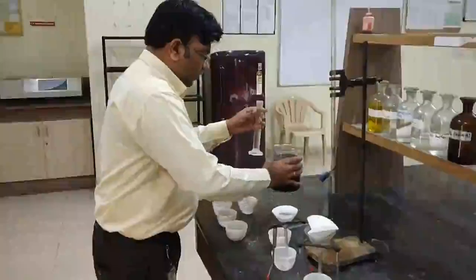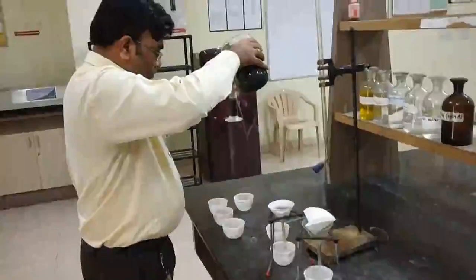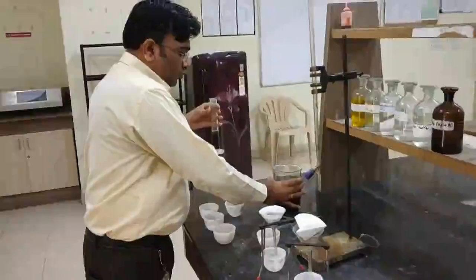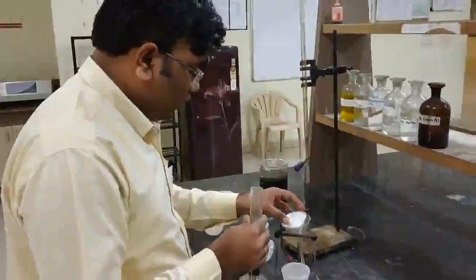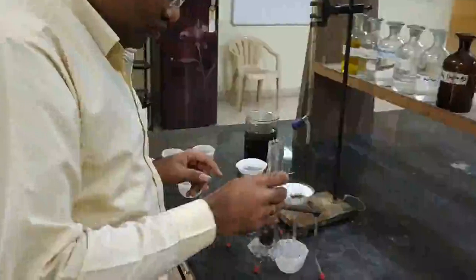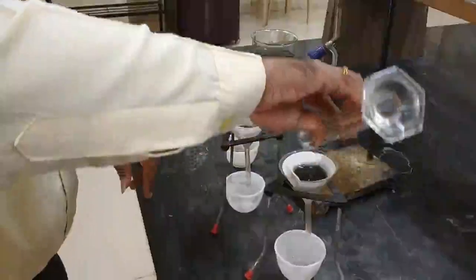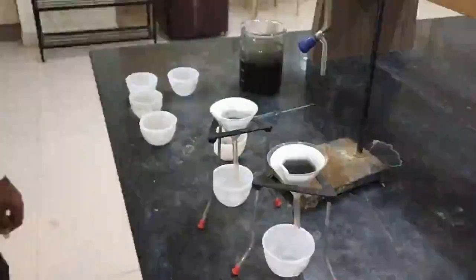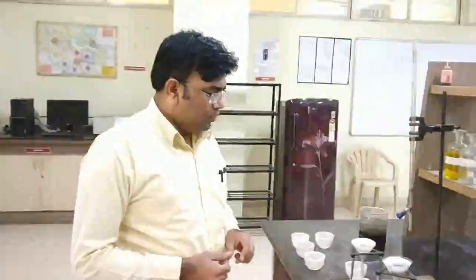So I am going to measure the 25 ml of sample, and I am going to pass it through the filter paper and collect the filtrate in the crucible D. We'll have to wait for a few minutes till this filtrate gets collected, and after that we'll be keeping these crucibles in the oven.